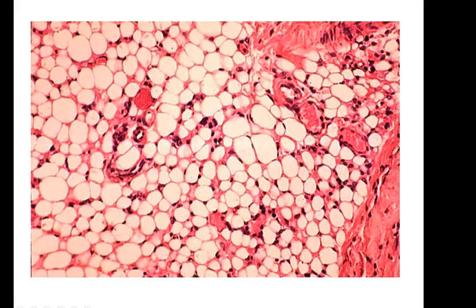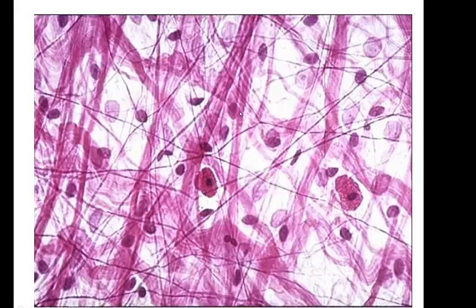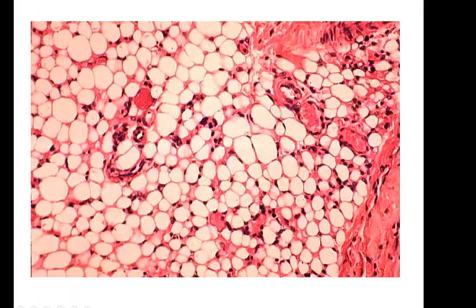It also helps insulate us against heat loss, so that's another function of fat. So our location would be underneath the skin. Also, we find it around organs to help cushion us, and underneath our eyeballs. We find it in breasts, so those are the locations. Notice in this tissue, our cell type would be adipocytes or fat cells. We don't really see any fibers at all, like back here in areolar connective tissue, where we see all these fibers. We don't really see many fibers at all in fat.